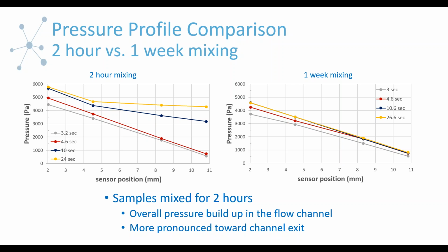You could probably speculate a variety of ways, but it seems there's a potential inhomogeneity in the system as you move through the channel, causing this pressure buildup. And it's most pronounced at the low flow rate, which is what looked like shear thickening, because the deviations from expected behavior are most pronounced there.